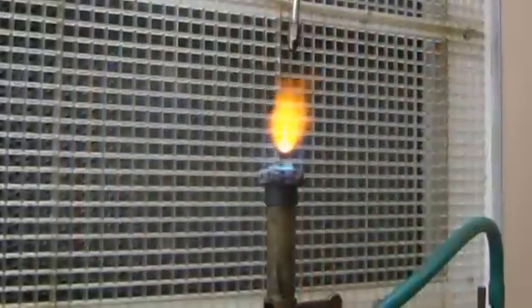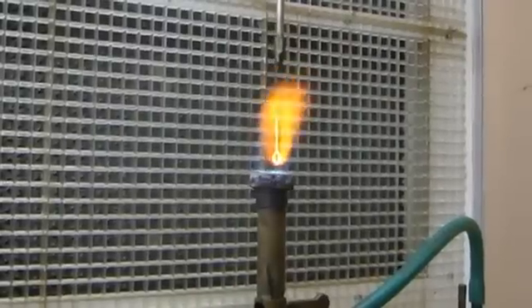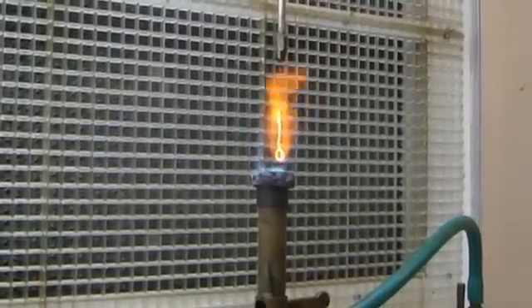The procedure begins by sterilizing a wire loop in flame. Cool the sterilized loop by allowing it to stand for a few seconds.